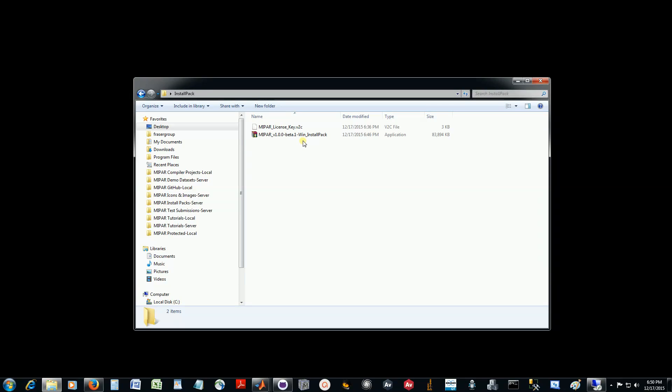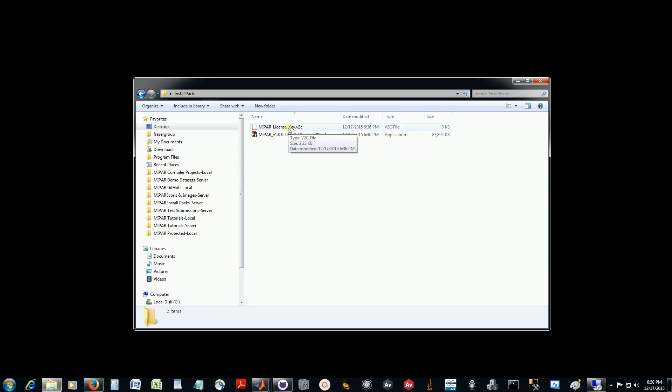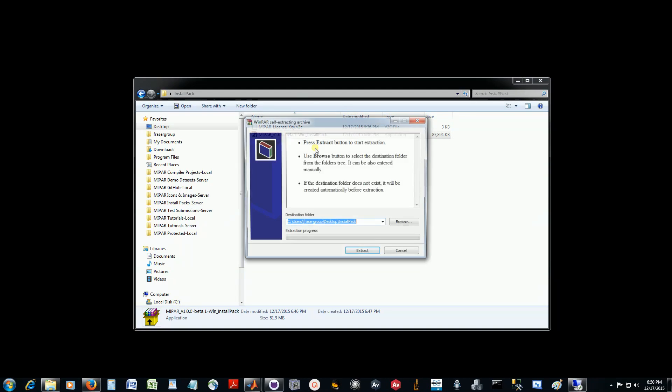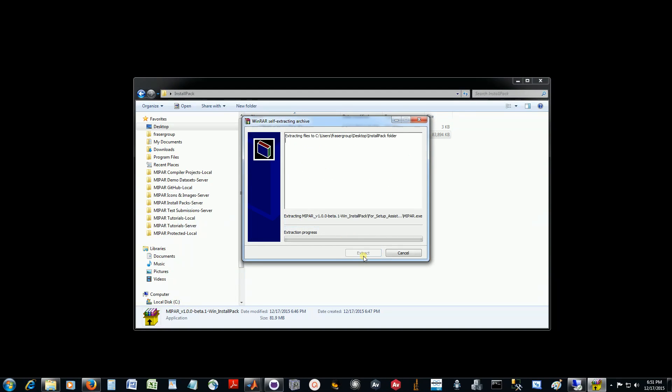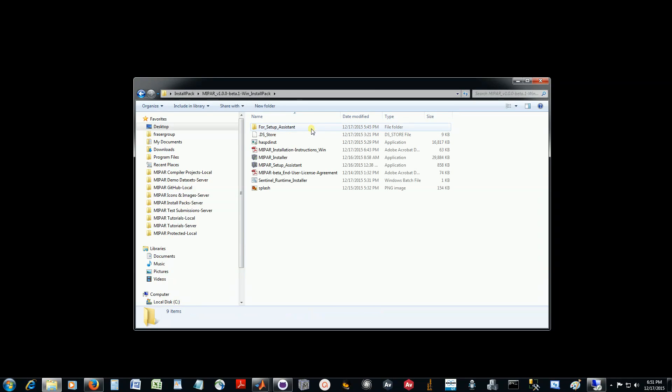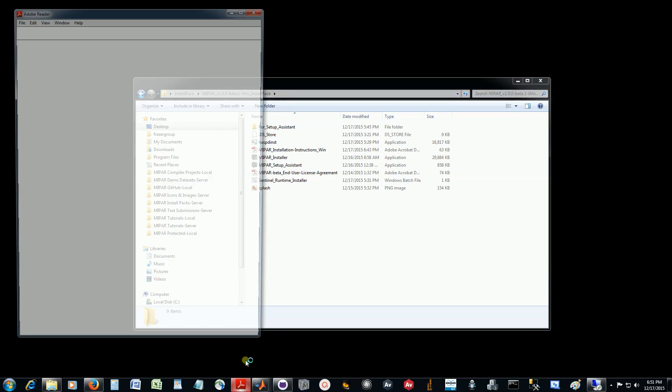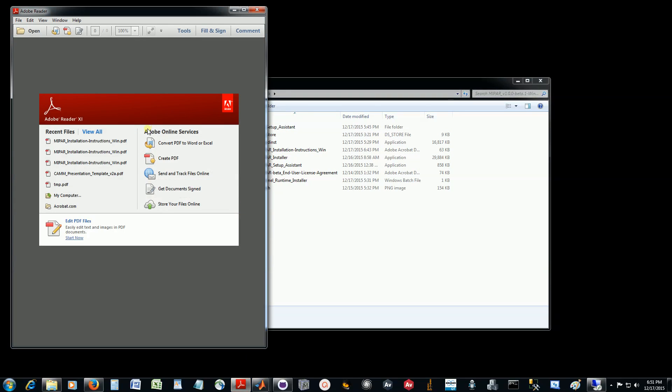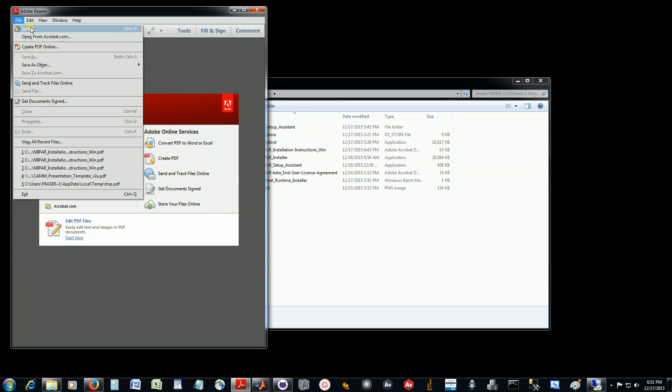Here I just have the install pack that you would have downloaded from MyPAR.us, either for Windows or Mac, and then the MyPAR license key that should have been emailed to you. To begin, I'm just going to double-click on the install pack to extract it, and we'll go into it and open up the install instructions so we can follow along.